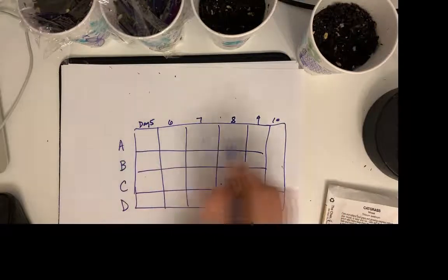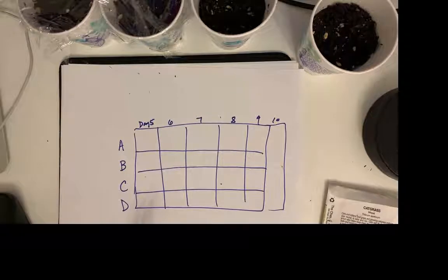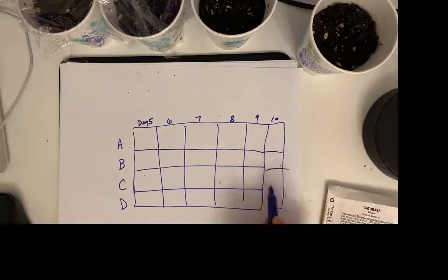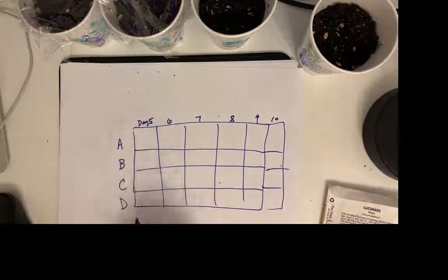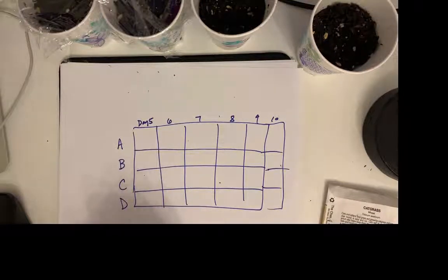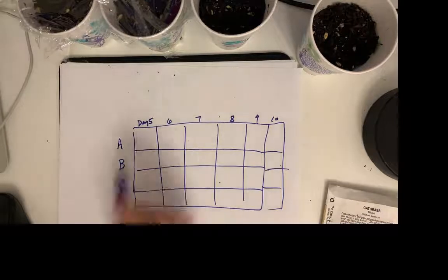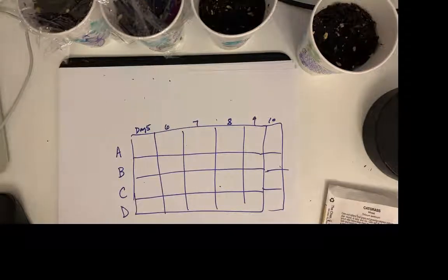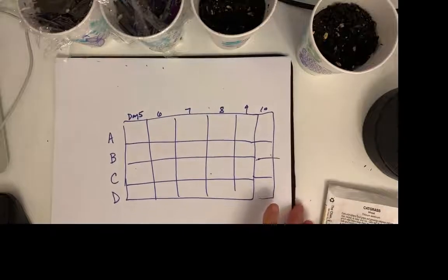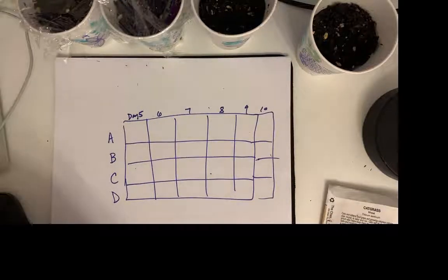And we're going to go for 14 days at least, because we want this experiment to be 2 weeks. I might be recording number of sprouts, the color, the height, things like that. I might say, 3 out of the 10 sprouted. You'll just sort of have to see what sort of information you need to write down.